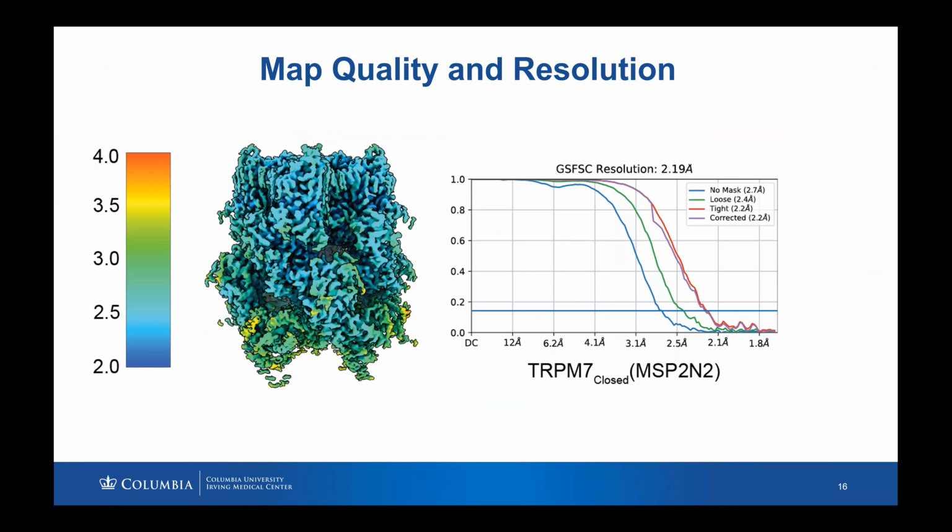So I just want to clarify the question. You're asking whether there can be an open state in the set of particles that resemble the apo state, or what are you asking? You said that further processing could resolve the open and the closed states in the gain-of-function data set. But if you don't see a lot of heterogeneity in that region, would further processing still help? So this is a hypothetical question, and I don't know the answer to this.